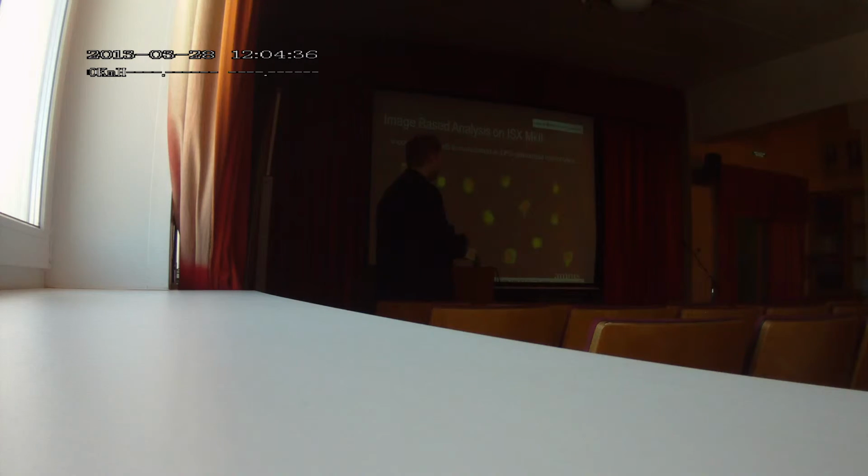So this is a sample of nuclear factor kappa B translocation, and this is basically what you would get under the fluorescent microscope. Now, could you tell if this sample is more translocated or more untranslocated? How would you objectively assess such an issue? You would say, okay, these cells are untranslocated. Or somebody else can come and say, this is translocated, the nuclear factor kappa B is in the nucleus. So who is right?